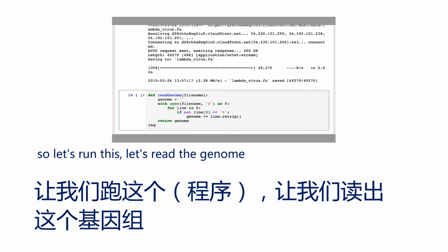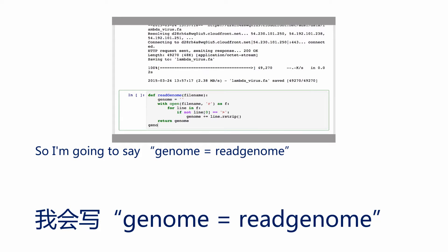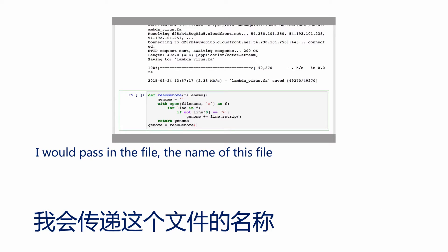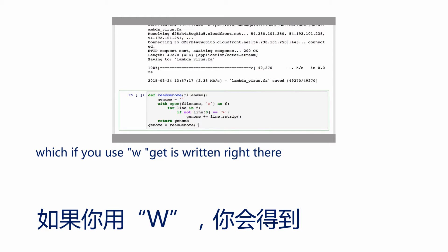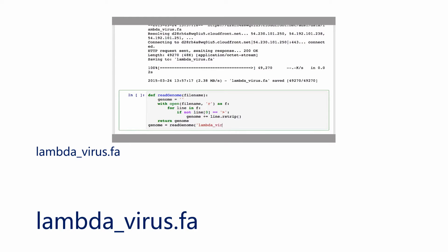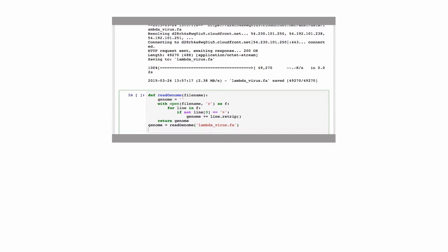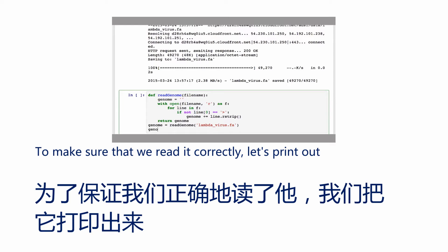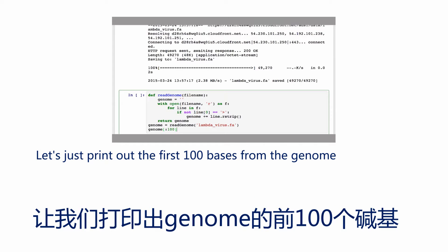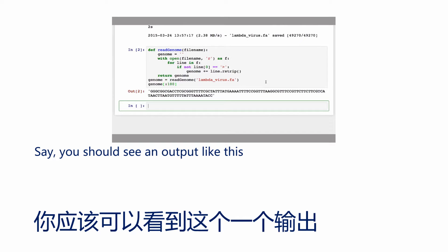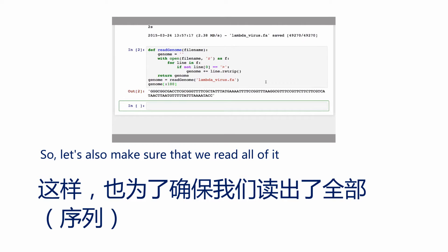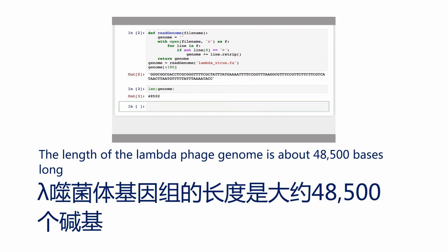Let's run this and read the genome. I'm going to say genome = read_genome() and pass in the name of this file — if you used wget, it is lambda_virus.fa. To make sure we read it correctly, let's print out the first 100 bases of the genome, and you should see an output like this. Let's also check the length of this genome — the length of the lambda phage genome is about 48,500 bases long.